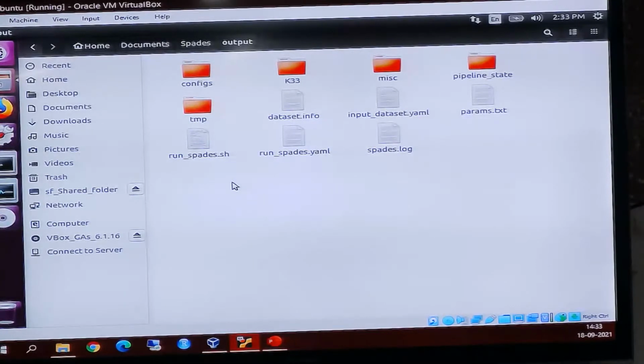If you have a reference sequence, there is another software used for assembly, MIRA, M-I-R-A. There are various genome assembly tools, but for small genomes, especially for microorganisms, we are going to sequence a very common bacteria. But we expect some alterations. Either de novo or reference based.